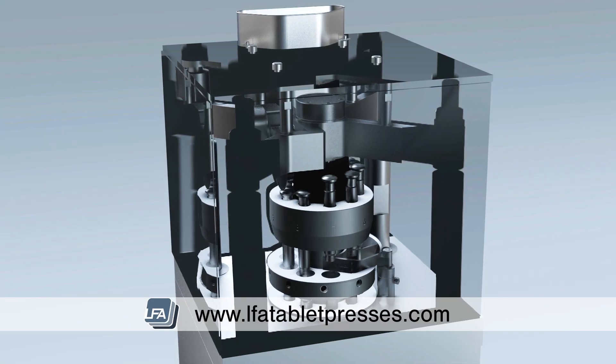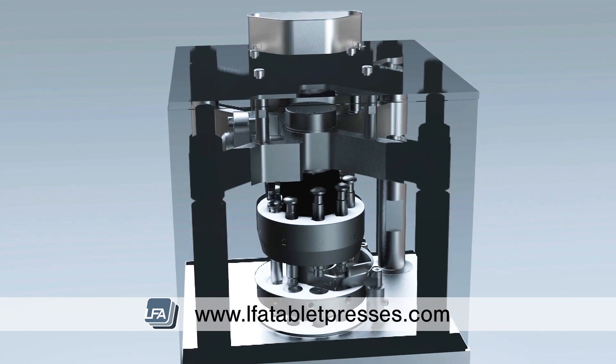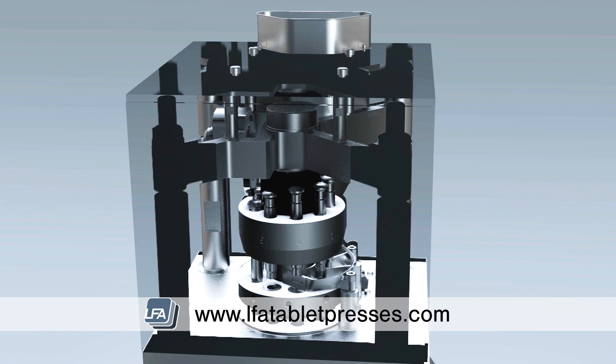Welcome to LFA's video on how a tablet press works. A tablet press is used to press a powder into a solid dosage form. The tablet press process can be broken down into four parts.